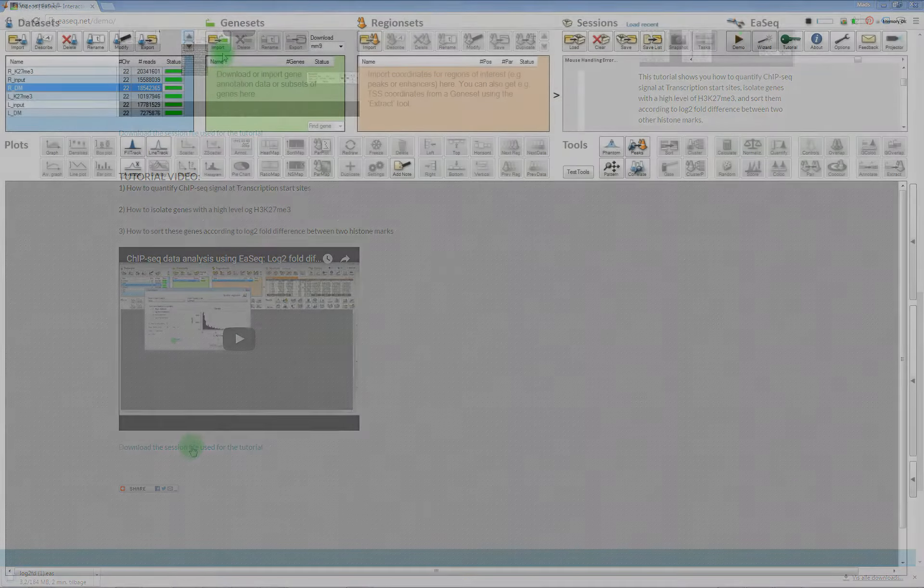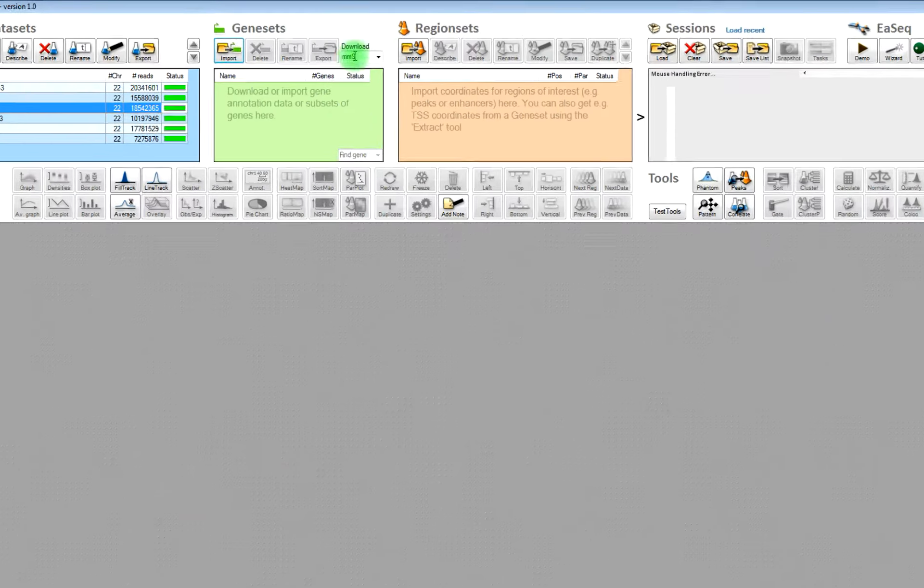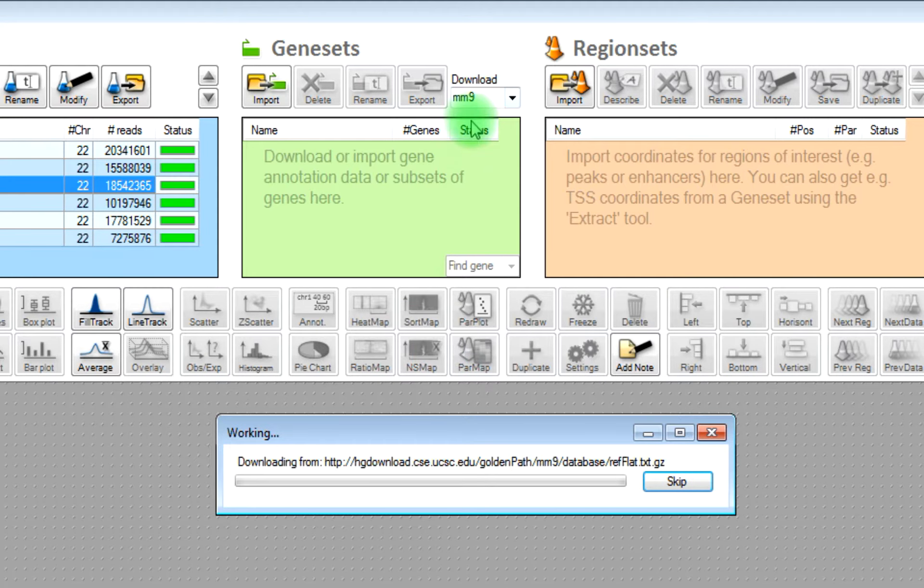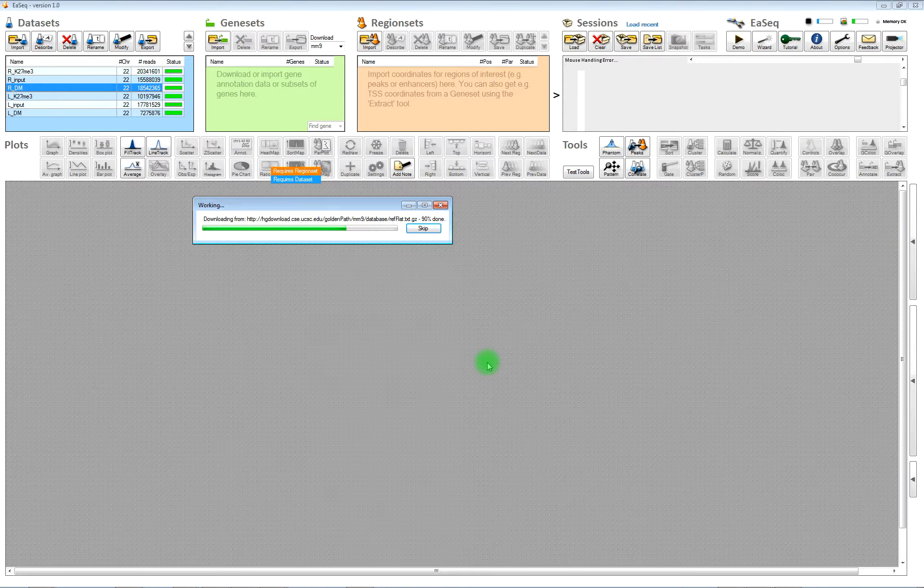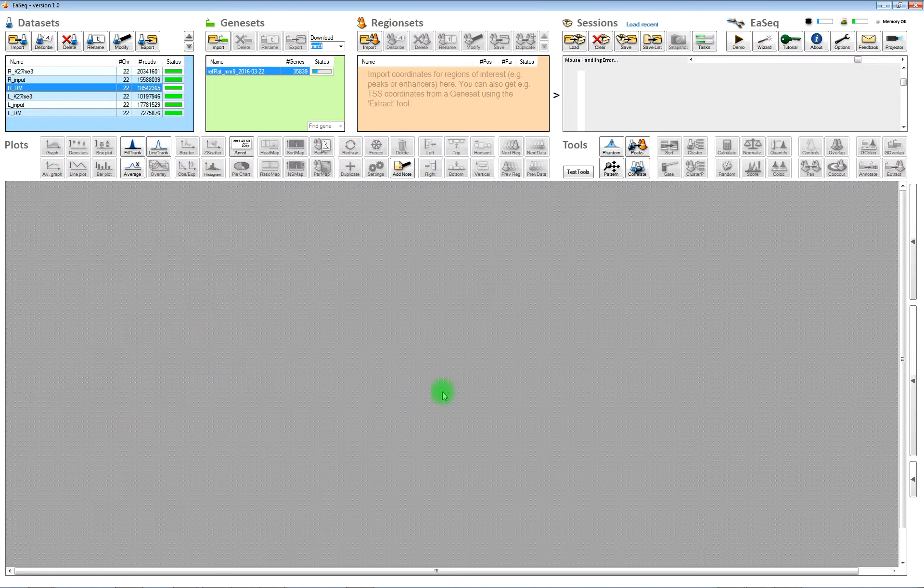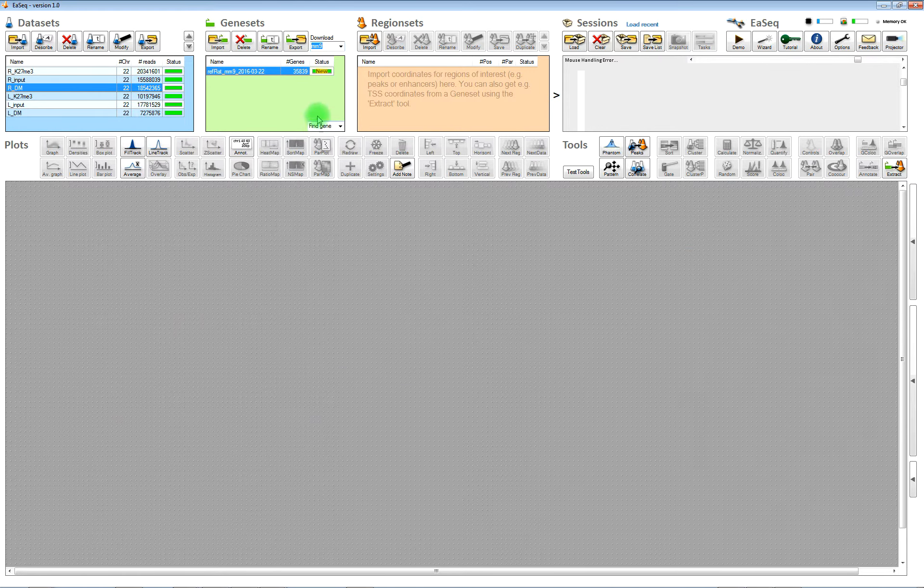You will also need to download some geneset if you don't already have one that you can load. You can do that by clicking on download below the geneset and it will take a while. After it's downloaded then you will see the import wizard and just click OK.